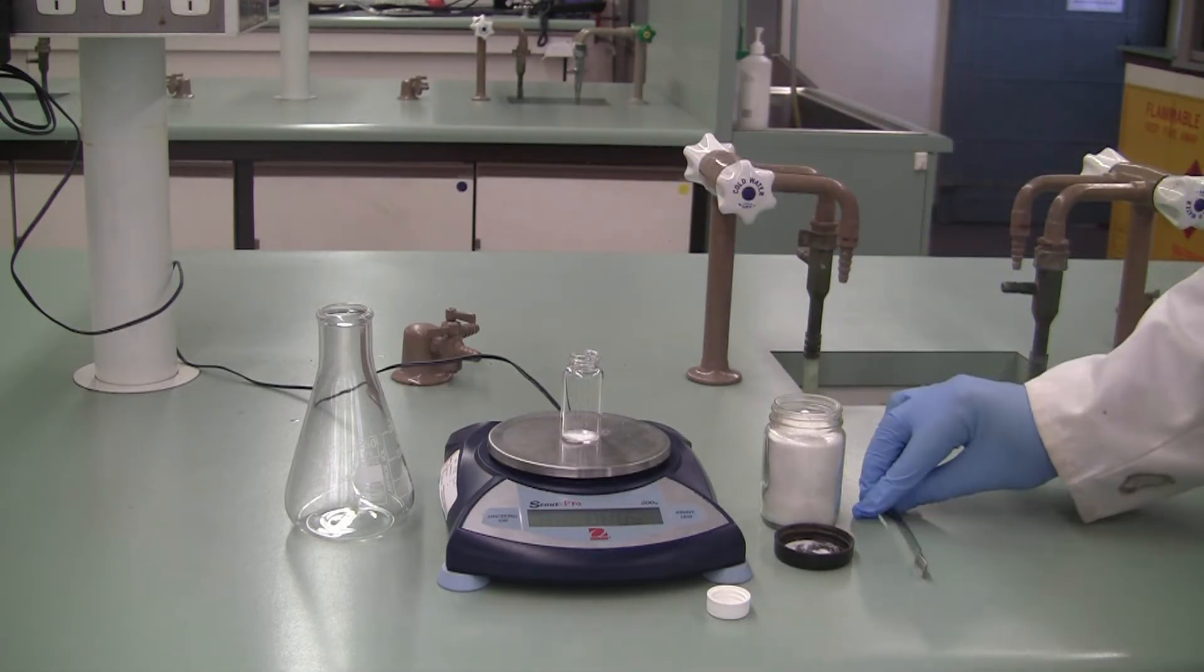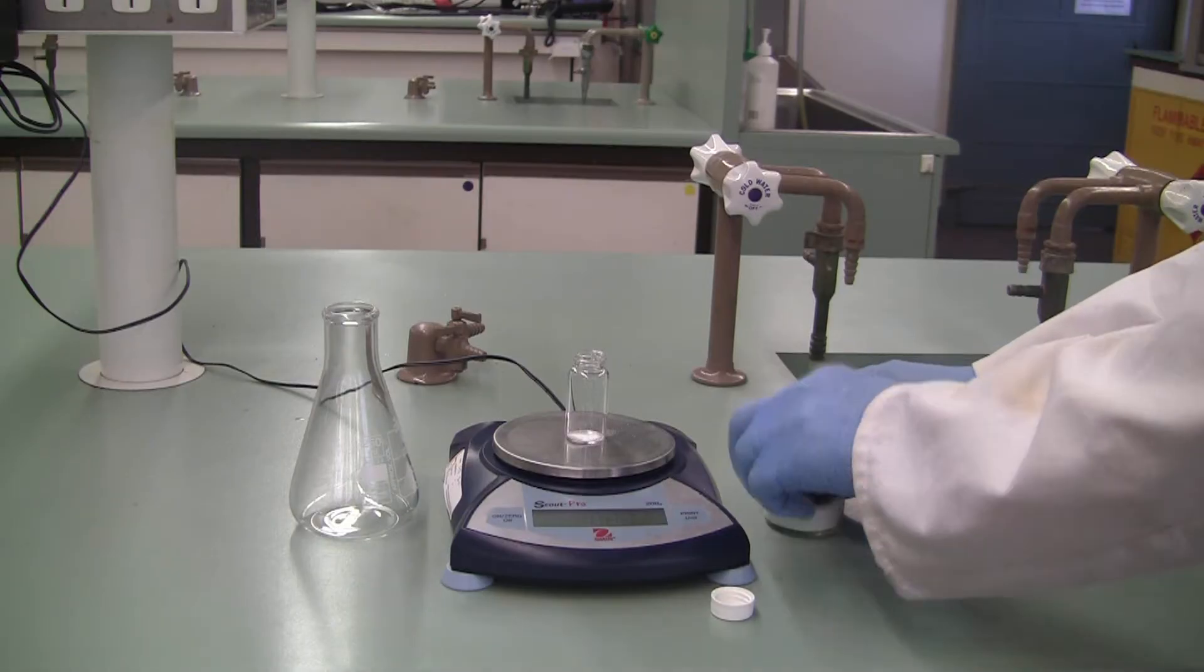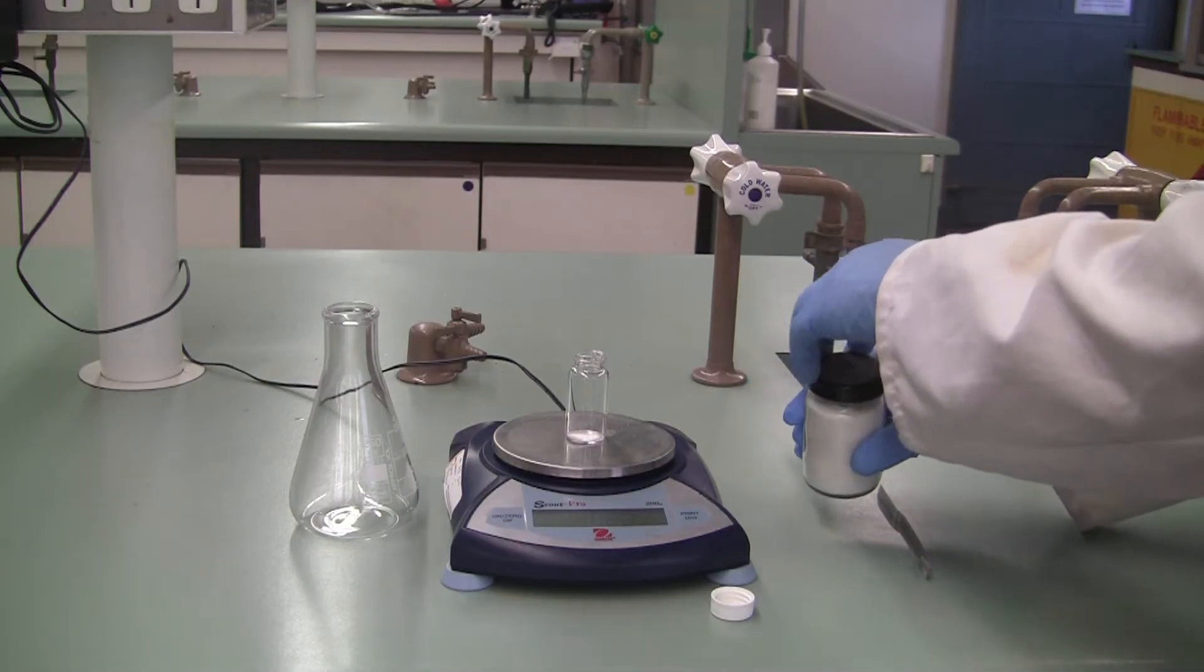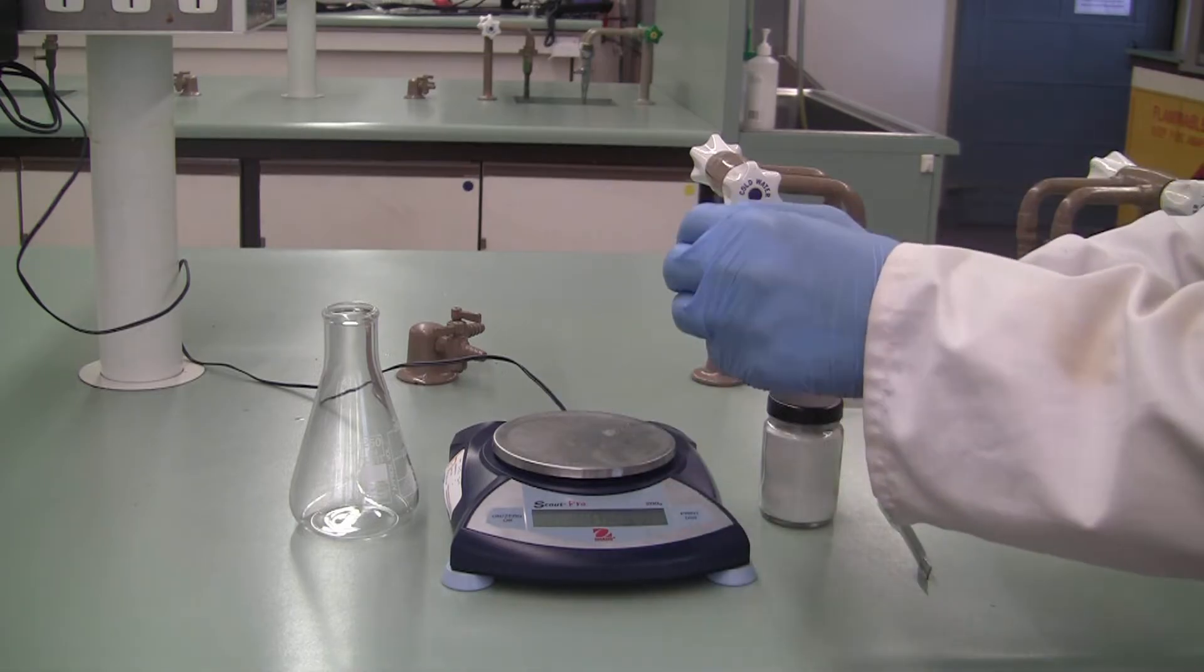Pop the lid back on the substance so it doesn't get contaminated, and put the lid back on your weighing vial so nothing falls in or out. Then head to the balance room.